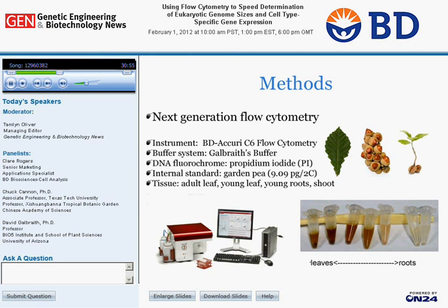We've explored a range of tissue types for extracting the samples, from adult leaves all the way over to young roots and shoots. You can see in the little diagram showing the tubes that the darkness of the liquid indicates that when you extract from the leaves, you get a lot of other compounds along with the nuclei, so it's a more difficult sample to accurately size. We found definitely that root tips were much better, so we were germinating seeds and taking the young root tips, and those were giving us very nice results. Next slide.